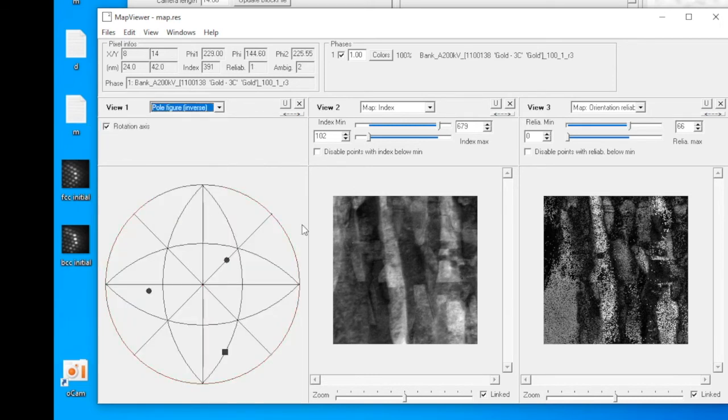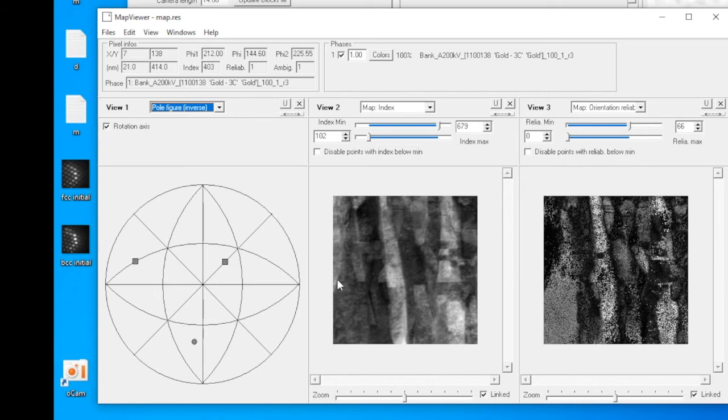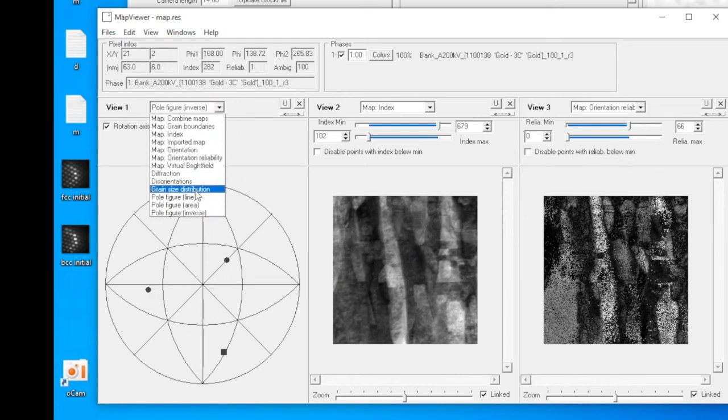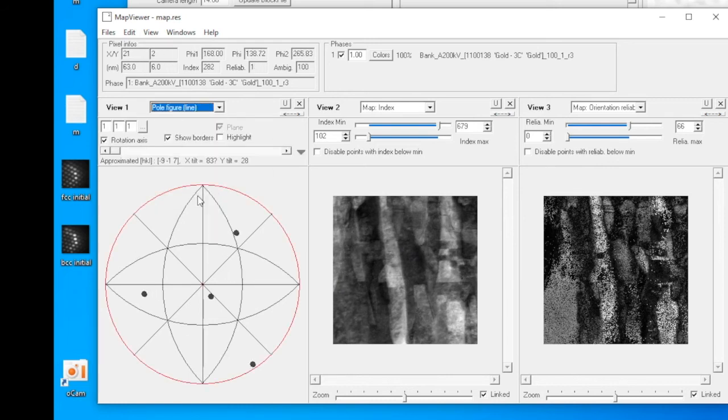The very last option is inverse pole figure. By clicking the mouse around on the micrograph, you can see the corresponding inverse pole figure.